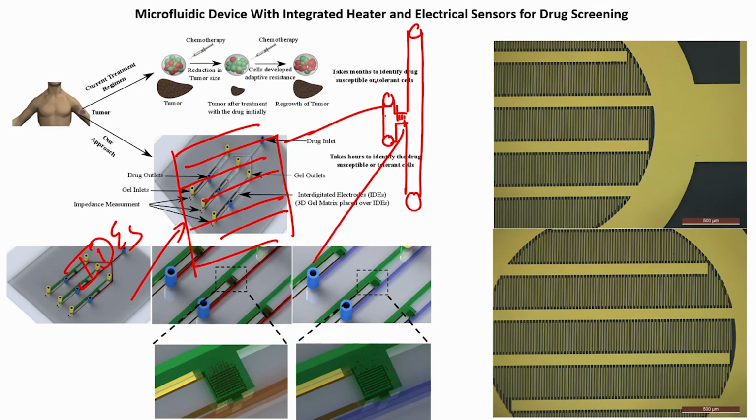I will load the cells onto this particular platform with Matrigel. So, cells with Matrigel. Where do you get the cells from? Cells from the patient.